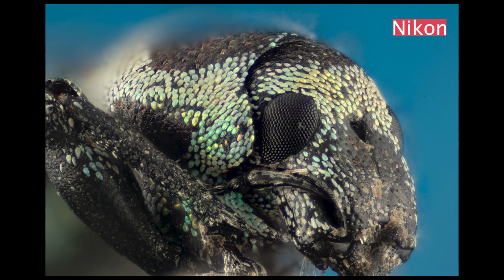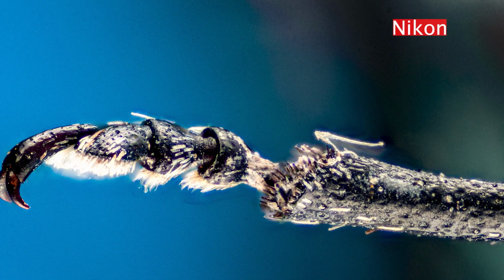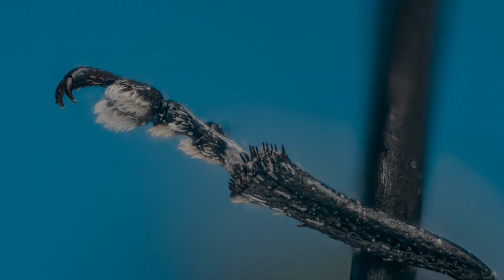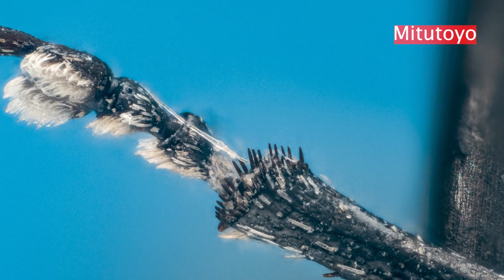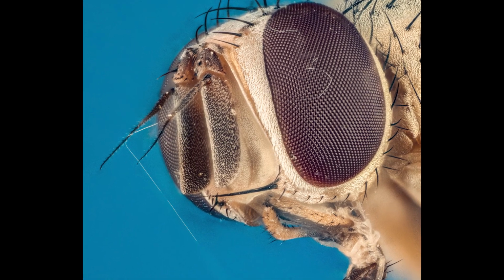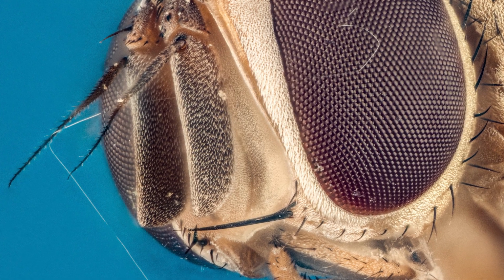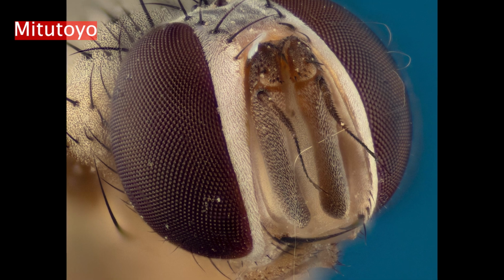The result is that the Mitutoyo images weren't really that good, but they still proved the point. And the point being, quite simply, that an apochromatic objective on an apochromatic relay lens is going to beat an achromatic objective on an achromatic relay lens every day of the week. Plain and simple. The image quality is not really even comparable. The Nikon shows evidence of significant chromatic aberration in many, if not all, of the shots. The images are overall slightly softer, and it was really fairly consistent right across the board. So I don't think there's any point in going through them individually.